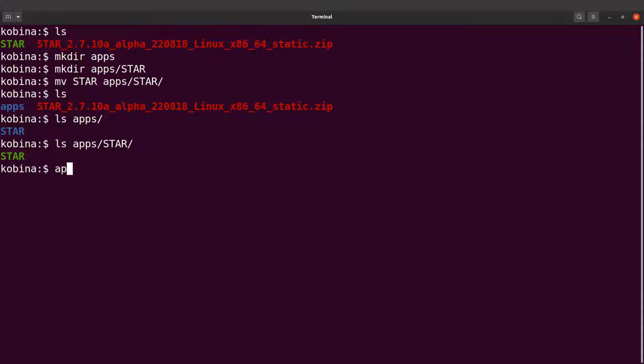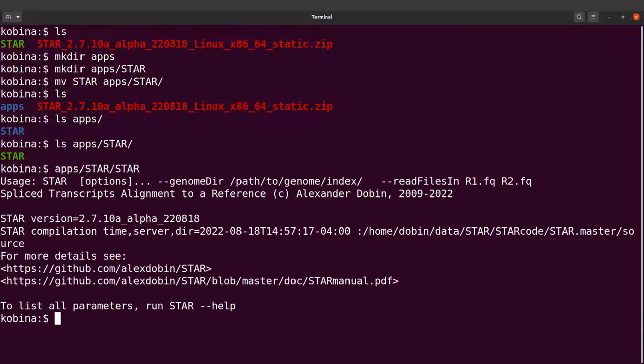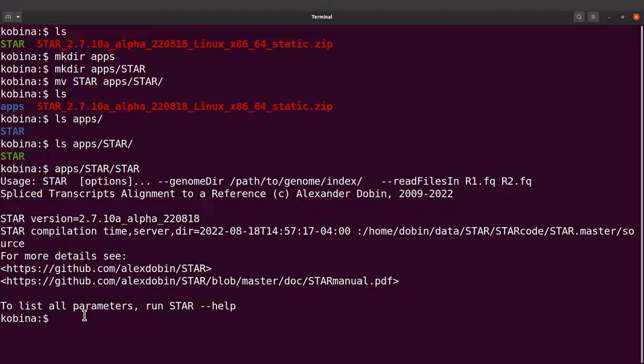Now if I do an ls, I'll see my apps directory. ls apps, I'll see my STAR directory. ls apps slash STAR, I'll see my file there. So if I want to call STAR, I will say apps slash STAR slash STAR, and then I can call this executable file. That's about it.